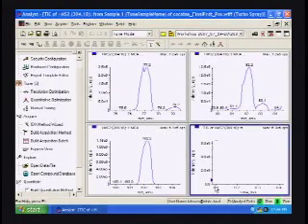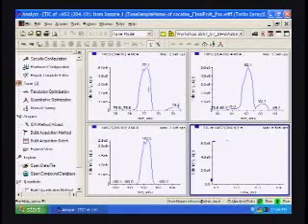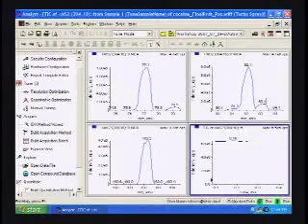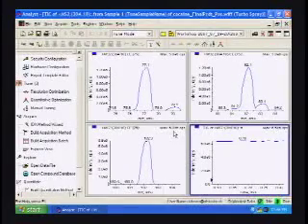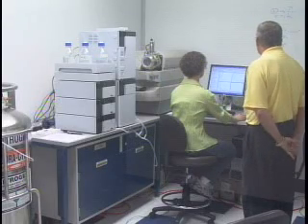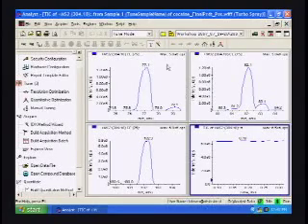Okay. This is the last pane that it's going to show you, and it shows the peak shape for each individual transition that is selected, I think. Is that correct? Yes. Okay. It's collecting 10 scans. It looks like it's finished.